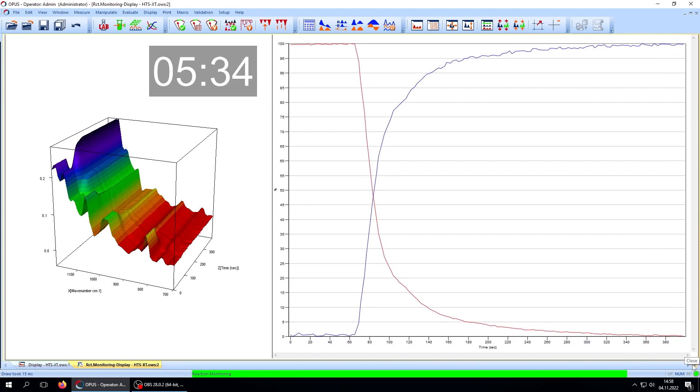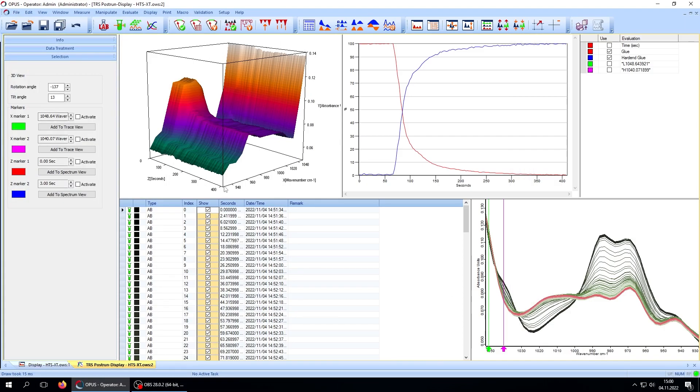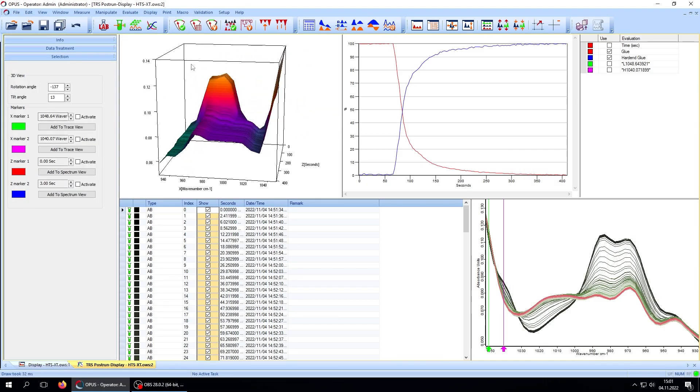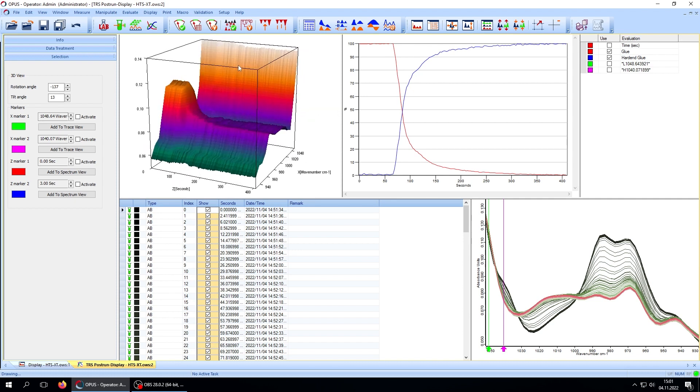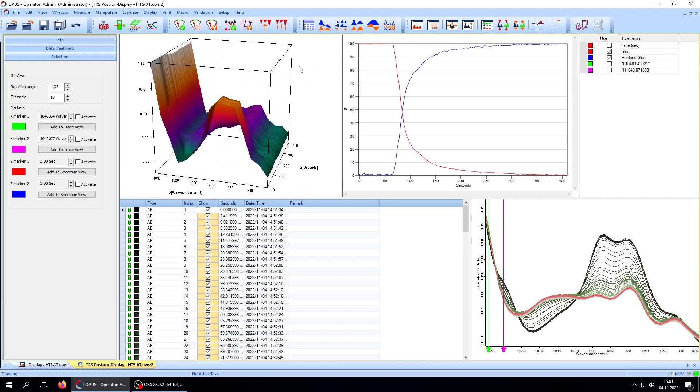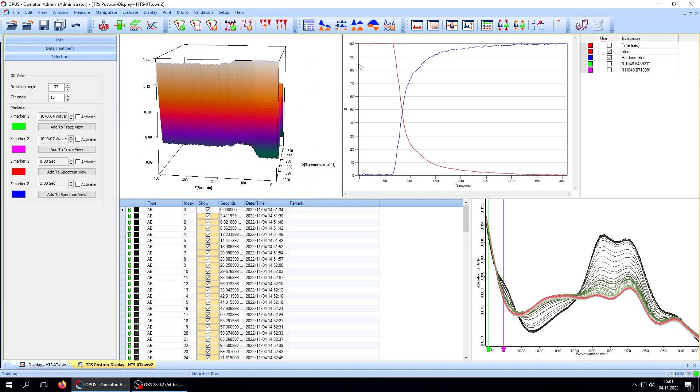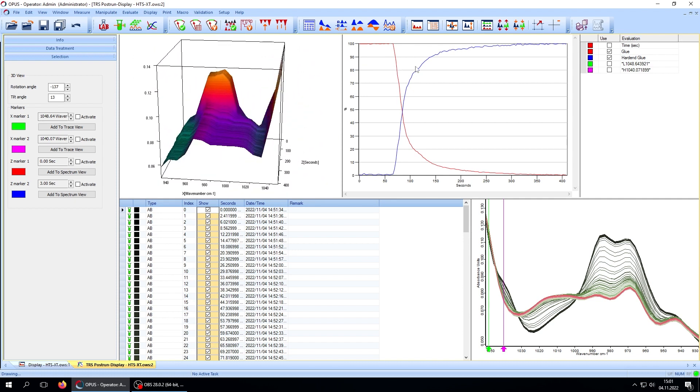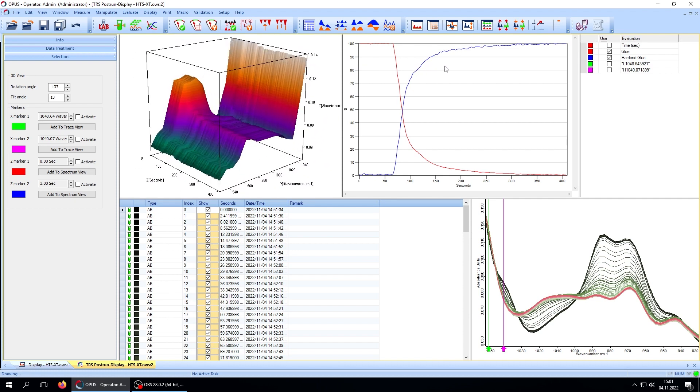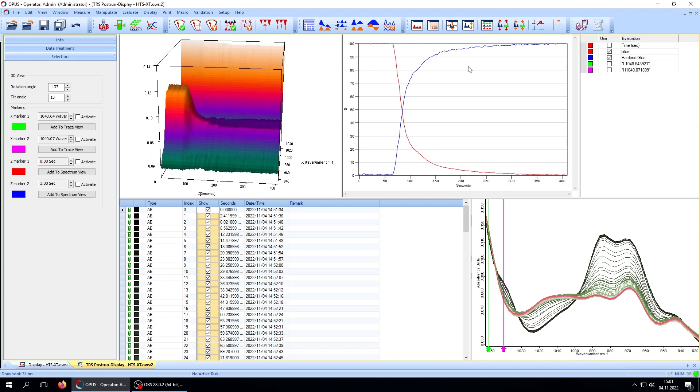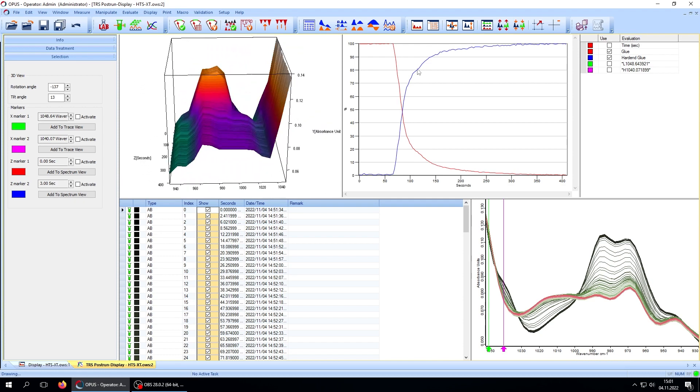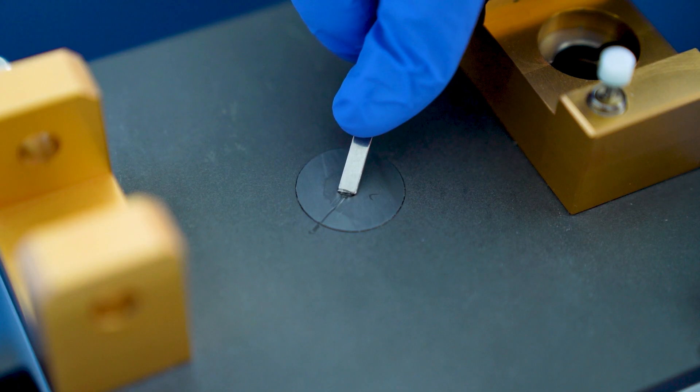At the end of the reaction, the software displays a result screen with the obtained information. You can access recorded spectra, take a look at the 3D plot, and draw conclusions on reaction kinetics or other parameters of interest.